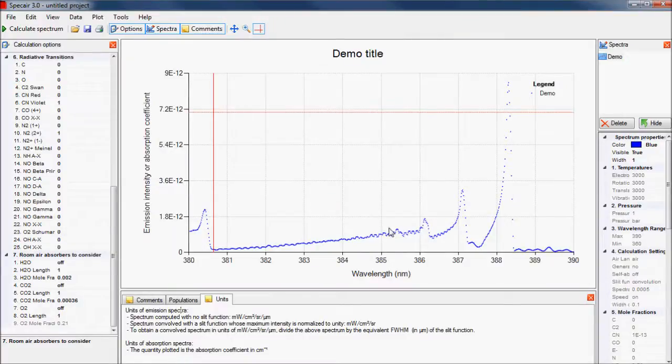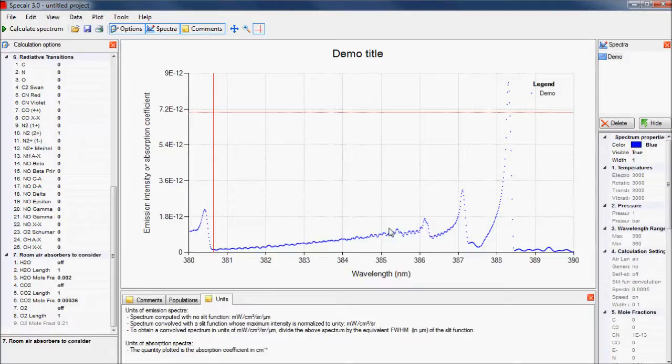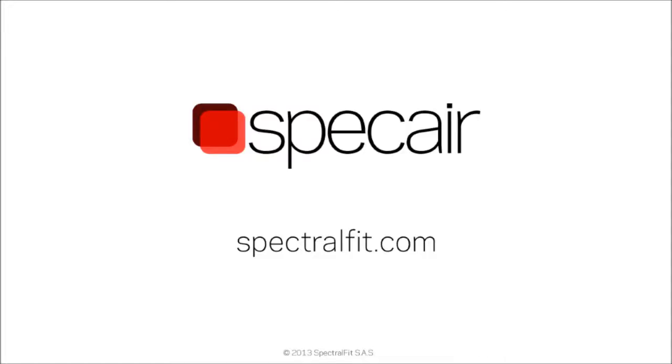To summarize, SpecAir provides a complete toolbox for calculating, manipulating, and fitting various spectra. Please try SpecAir, which is available for download at spectralfit.com.